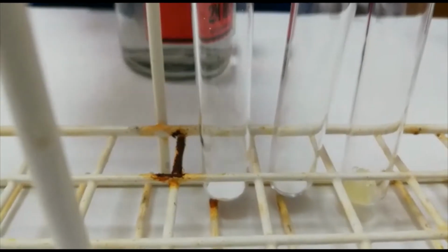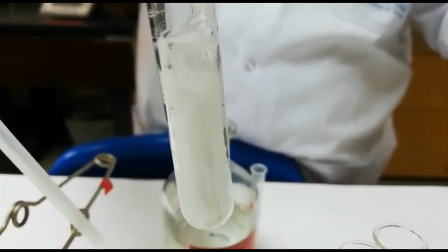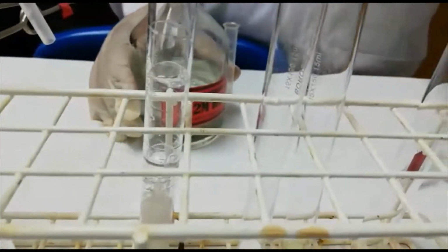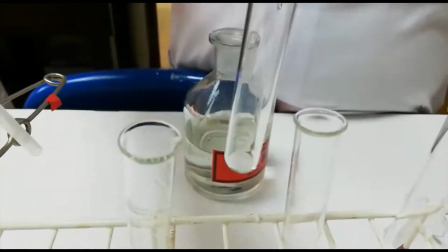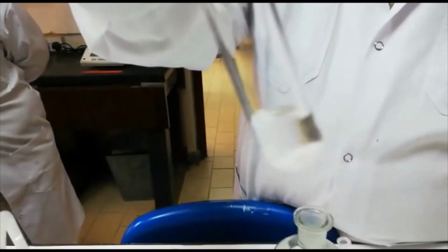And carbonates, when we are adding HCl, you see that the gas is produced. This gas is colorless and this is carbon dioxide. So this is the identification of carbonates: if you add HCl, carbonates react with HCl producing carbon dioxide. And the second one, sulfite, when we add HCl, the gas is produced, but the gas is colorless and it has a bad smell. Sulfur dioxide gas is produced in this case.